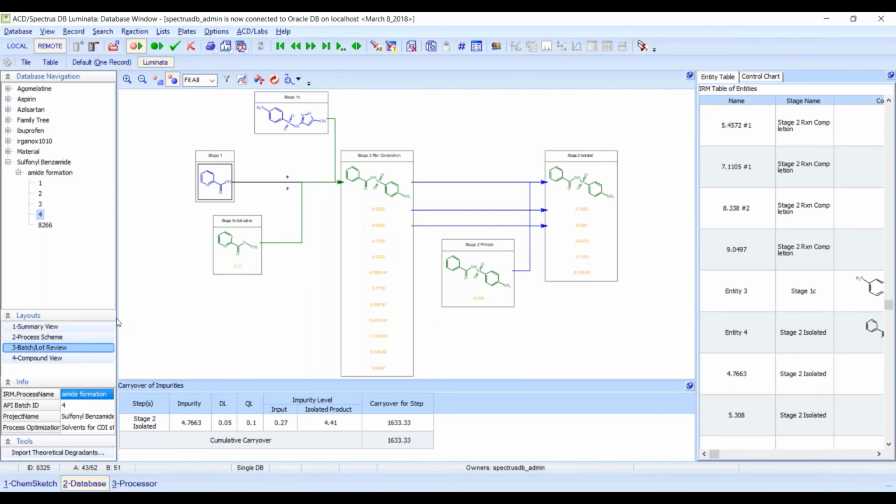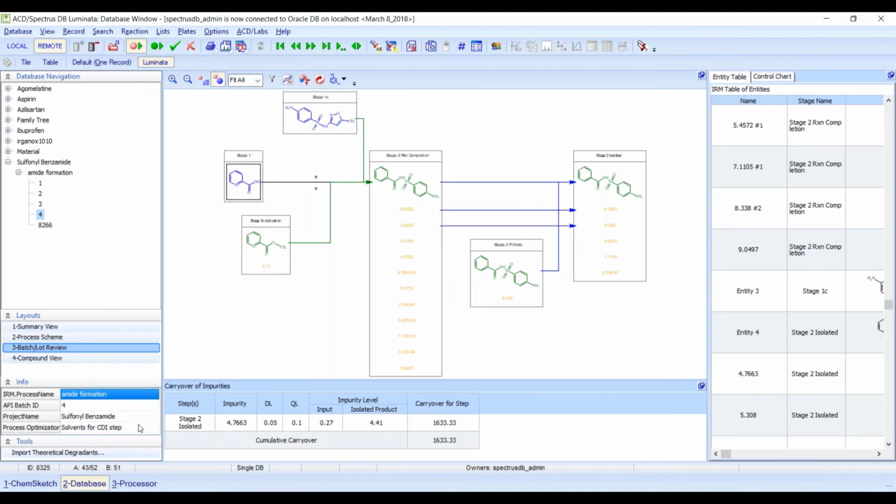And also within every record, you'll note, I can have my process optimizations and discuss what's occurring within this one batch, having that information seen here. All that information is being stored. And like I mentioned, this is something that's very difficult if people are doing it now. Either they have the record, it's already been pasted in, and all the data abstraction that they've had is static, just PDFs, with no way of searching and delving deeper into that particular synthetic route that they've done.